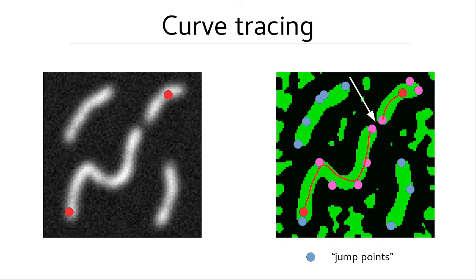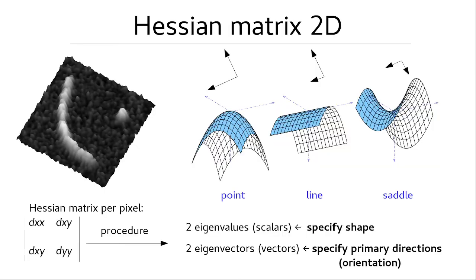And then one can run 2 Dijkstra algorithms for 2 areas around the 2 points, which should be fast, since these areas are pretty small. Then find the jumping points that were included, marked here in pink, and quickly find the two closest jumping points among this set. Since these jumping points are the tips, one can simply connect them by a straight line. This combination works much faster than visiting all voxels of the dataset and using the classic Dijkstra algorithm.